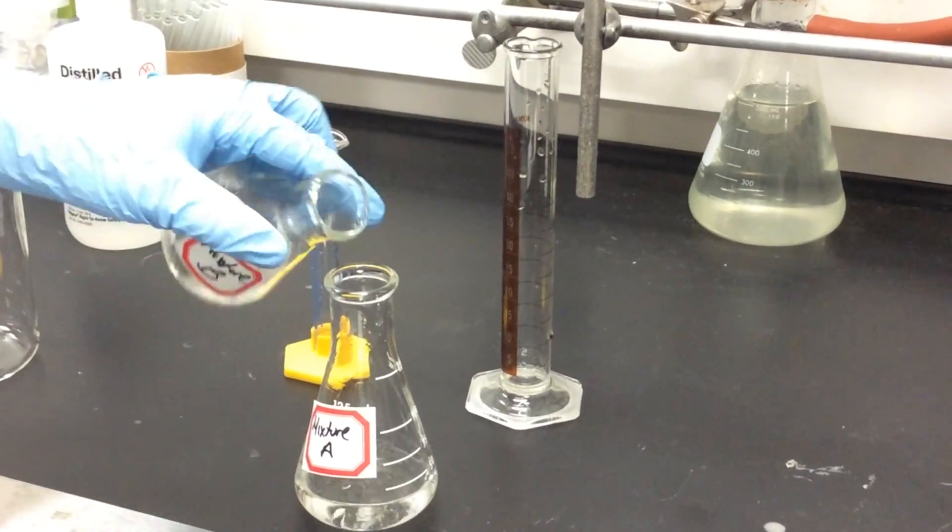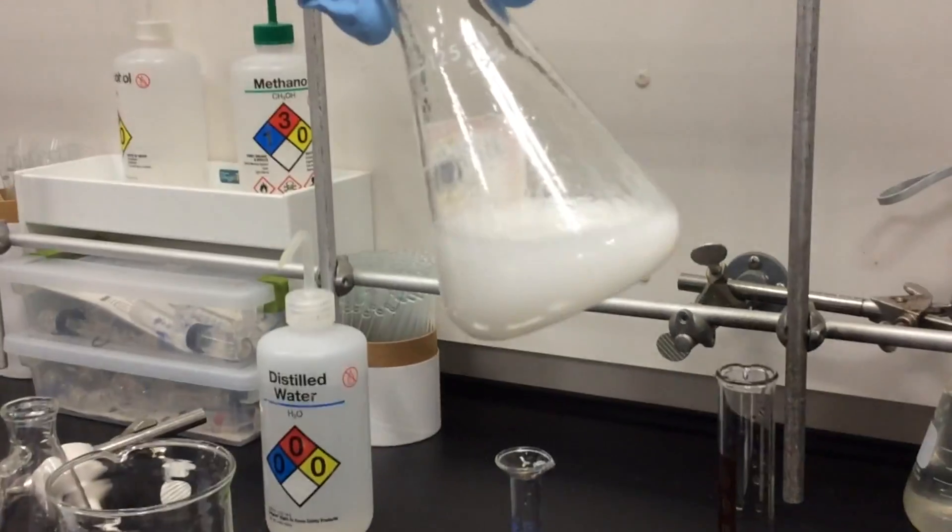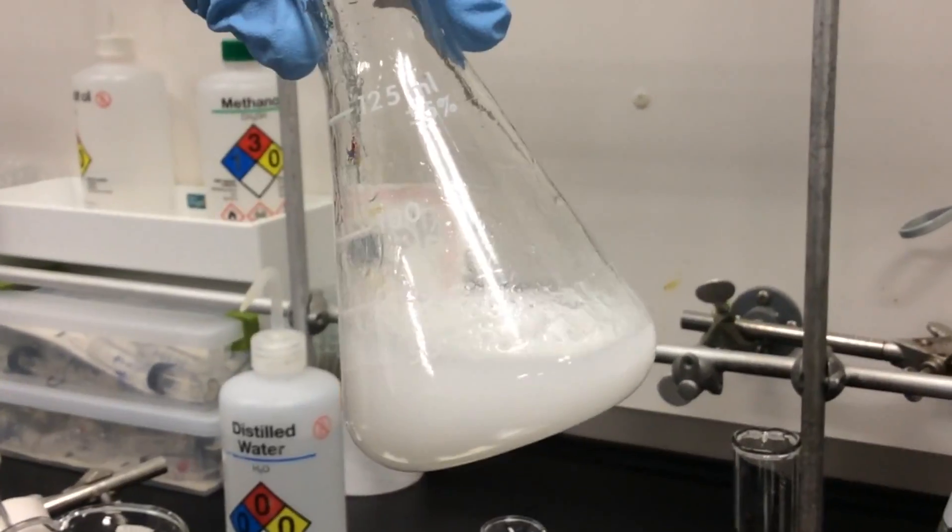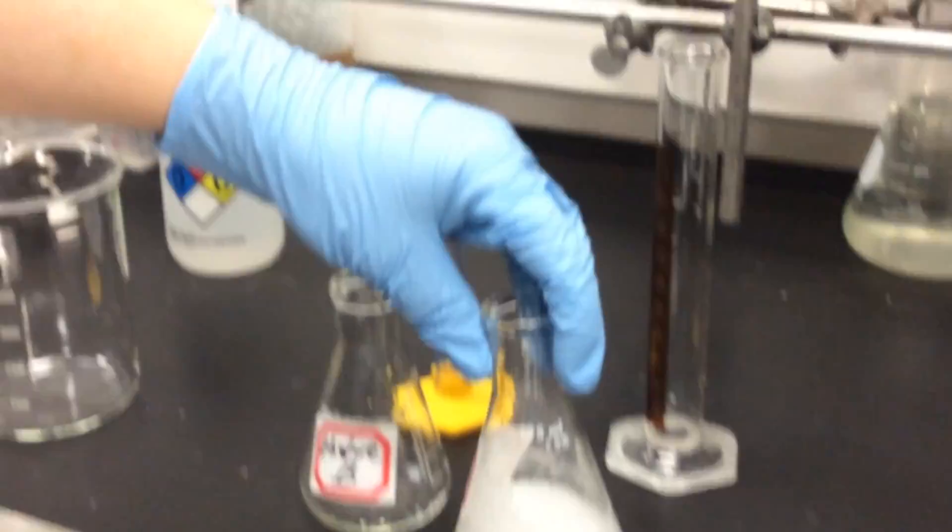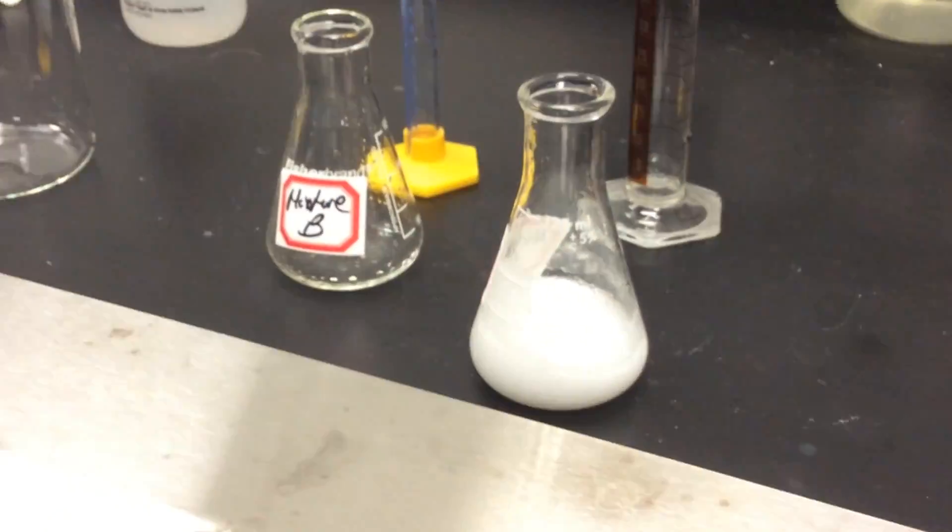Now we swirl both flasks, pour mixture B into mixture A, take the mixture A flask, and as you can see immediately white crystals are starting to form. This is actually our product, our acid anilide, which we have now synthesized.